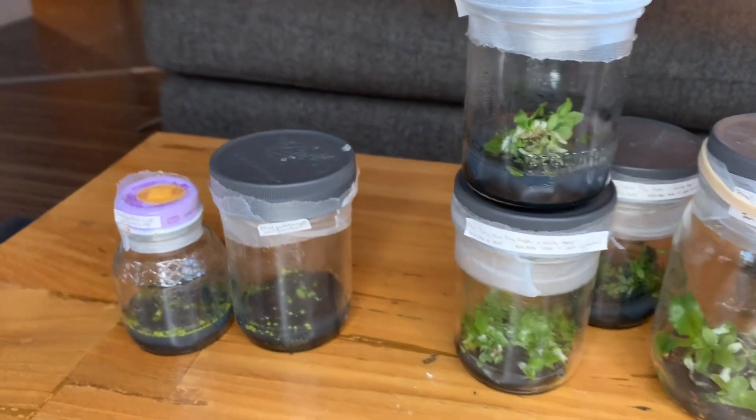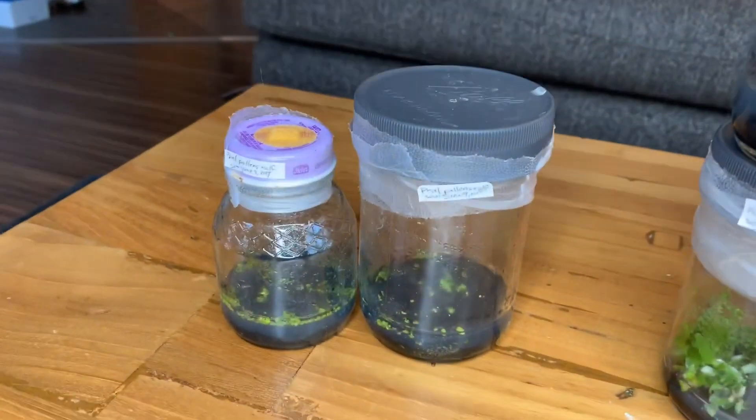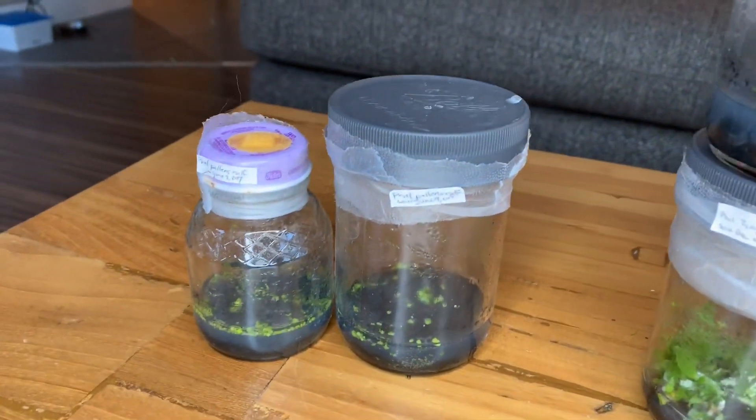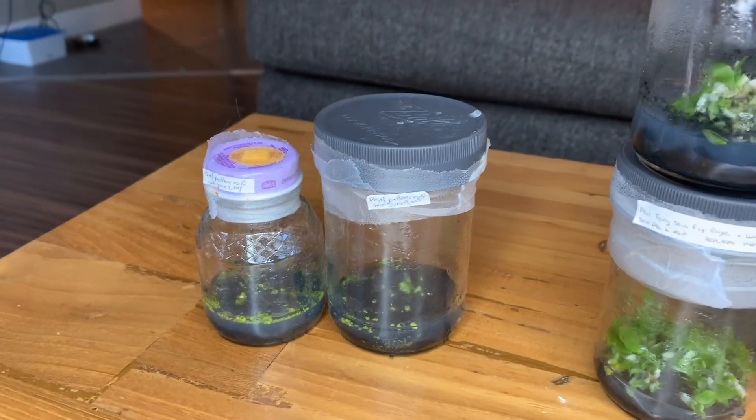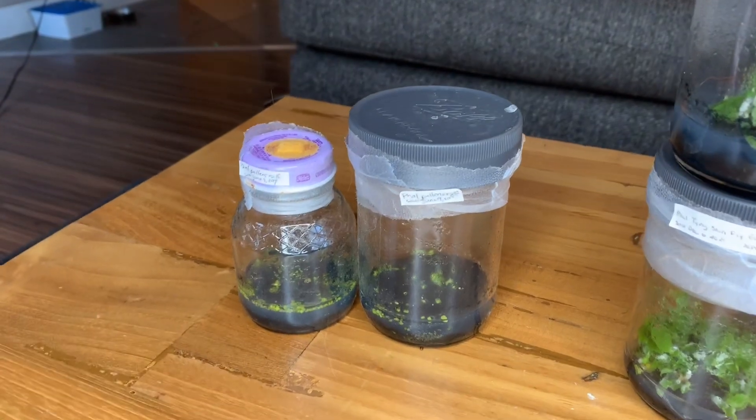They are alive. The ones that we all-flasked together are doing okay — there's protocorms in there. I may replate those, but I'll save the replating for a video and we can do that together. That's pretty much it for the flasks. I kind of want to do a quick update on the rest of my plants. I'm going to walk you through some of the plants that I have on the go right now that I've talked about in the past, and maybe some of the ones that I haven't.